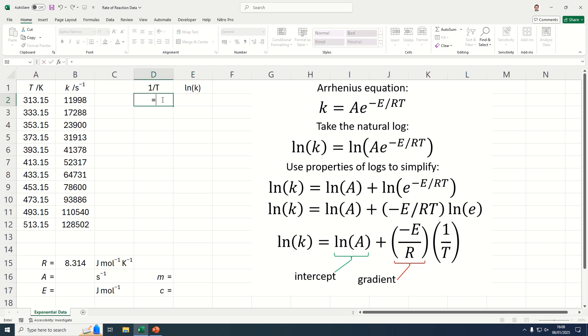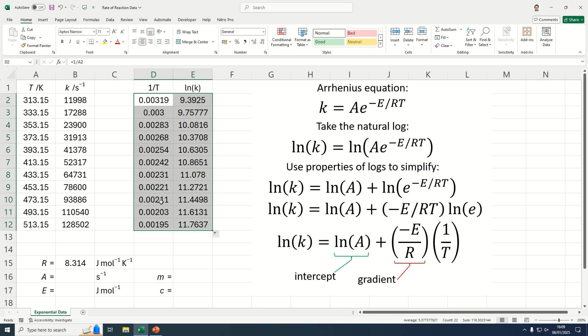So we simply write equals, select that cell, or rather we need to do 1 divided by and then we select that cell. And then here for the Excel function we just use LN, open brackets, click on the value, close the brackets. And then we can simply drag that down and we get the values that we need.